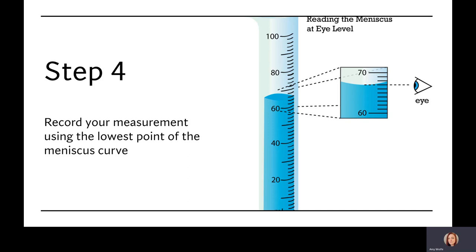Look at the horizontal lines on the side of the cylinder and find which line the meniscus is closest to. Then determine the increments of measurement on the tube. For example, if the area between the 60 milliliter mark and the 70 milliliter mark is divided into 10 segments, each segment represents 1 milliliter.